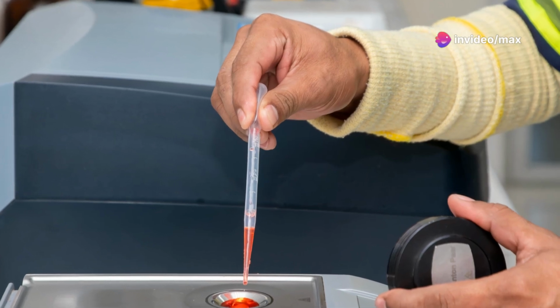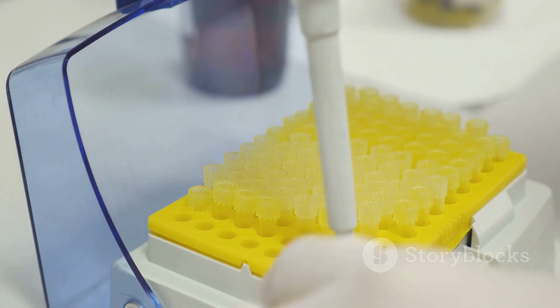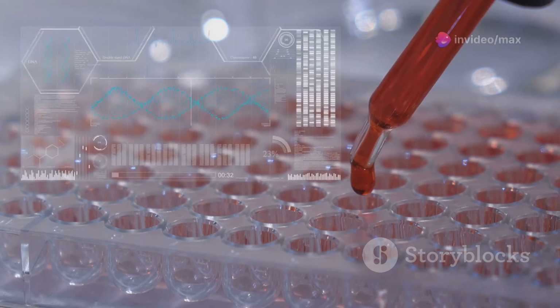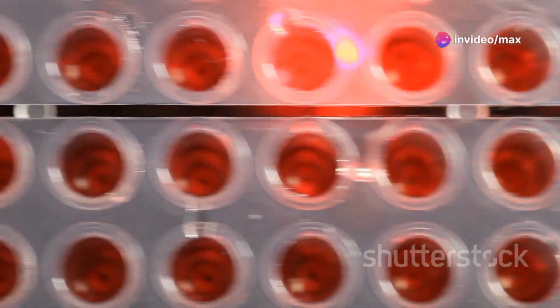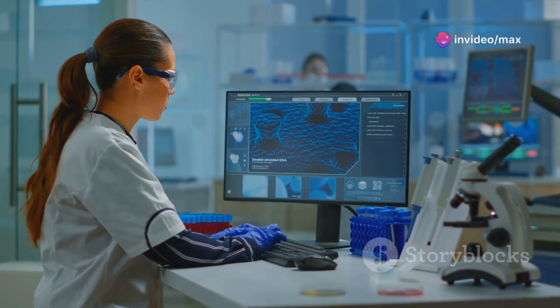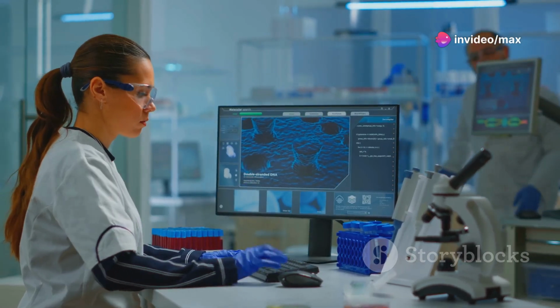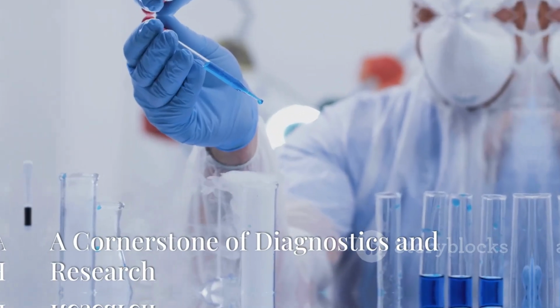Fourth, unbound antigen is washed away. Fifth, the substrate is added, and the enzyme linked to the labeled antigen catalyzes a reaction, producing a detectable signal. The intensity of the signal is inversely proportional to the concentration of unlabeled antigen in the sample. By comparing the signal intensities to a standard curve, researchers can accurately determine the concentration of the target antigen in the sample.